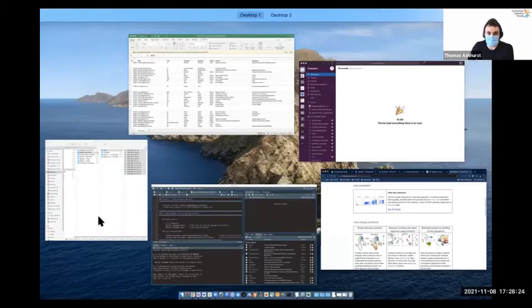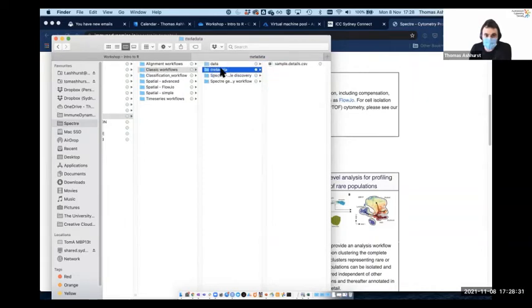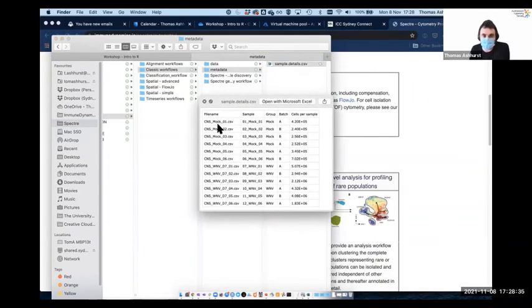And then when you export the CSV files, you get something that looks a little bit like this. So we get a folder for data and a folder for metadata. There are some instructions on that page to talk about it, but this is essentially just so that we can have information that relates to each sample in a tidy format so we can import this easily. This is going to be important when we come to do things like our statistical analysis.